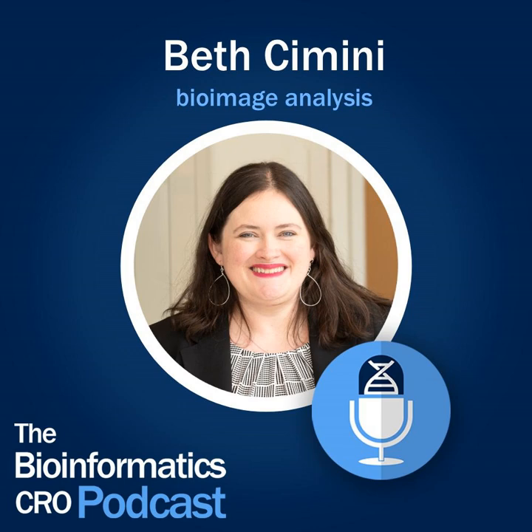What kinds of questions do people ask repeatedly, and what do those repetitions teach you? Yeah, I think one of the most common questions that we get, so there's an online image analysis help forum called image.sc, which, if you remember nothing else that I say today, remember image.sc. It is the central help forum where more than 60 open source tools have one central help forum, and it's a really friendly place to go and say, I have a picture, I want to know this about it, please can somebody help me? And probably 10 people will.